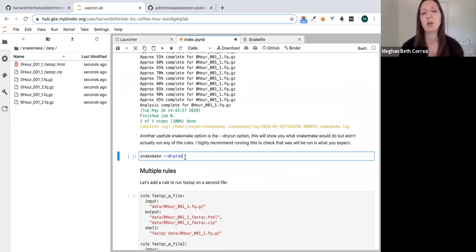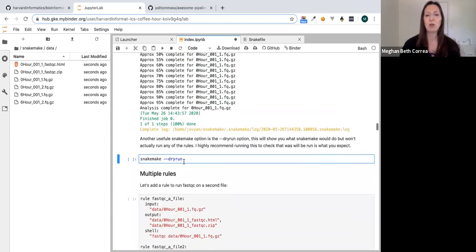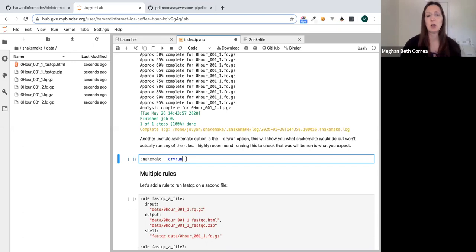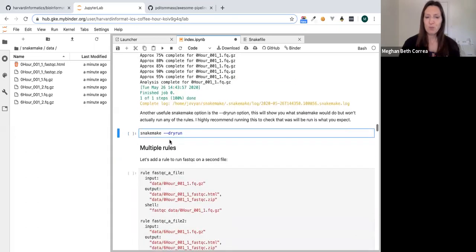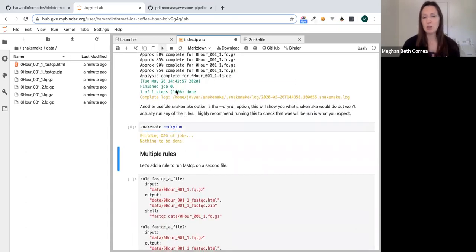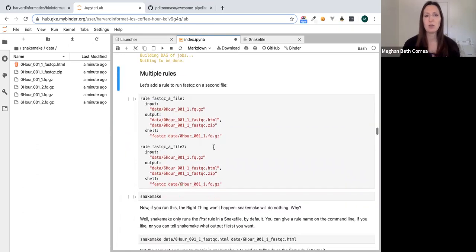One really useful option is the dry run option. When you run Snakemake in dry run mode, it shows you what it plans to do but won't actually execute any rules. This is very helpful when you have many steps and want to confirm what's about to run — especially since Snakemake pays attention to completed steps and file modification dates. If we run dry run now, we'll see there's nothing to be done.